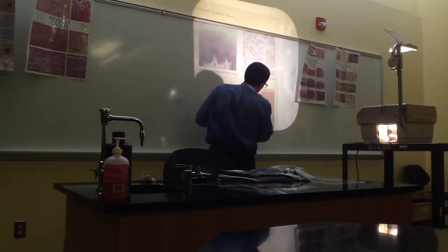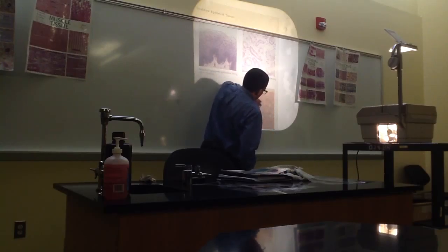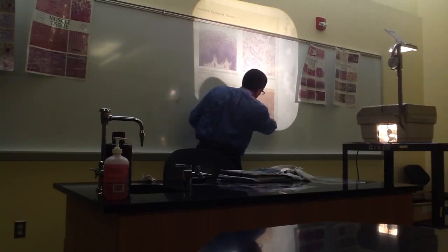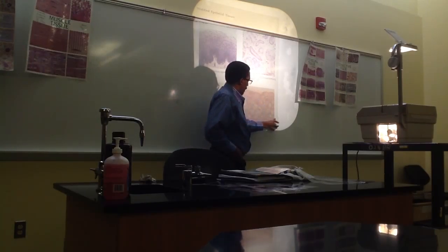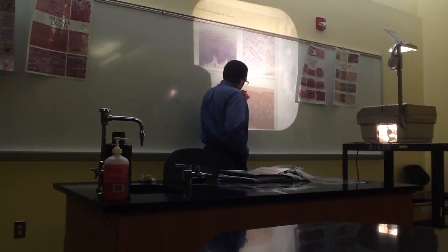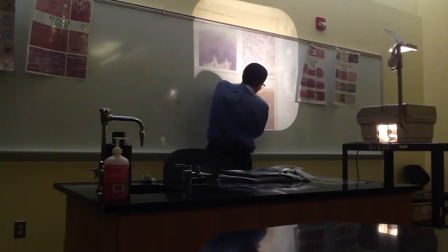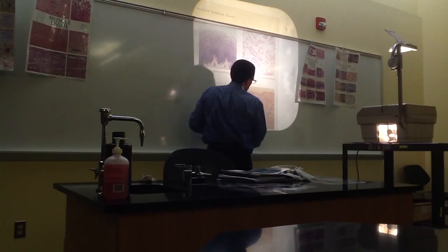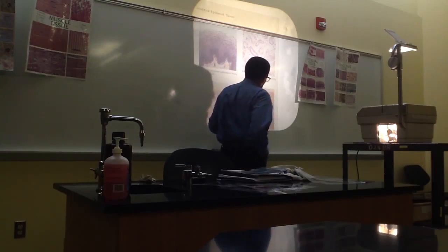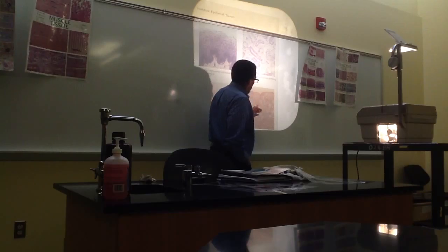All right. So we got whatever type of tissue this is that stains this way and looks this way, and then all of a sudden we got something different from this point on down. So what is this? That's the basement membrane. Okay, so now we got to identify these tissues. Do they look simple or stratified? Stratified. All right, it does look stratified.